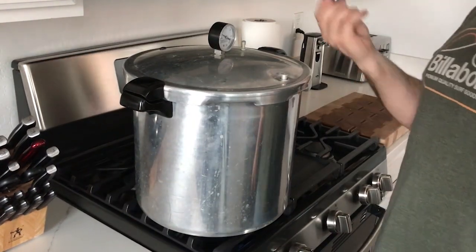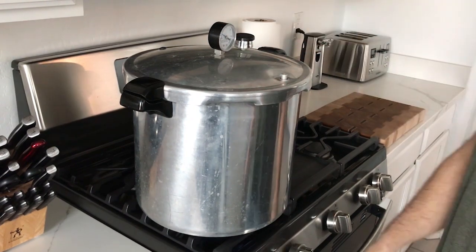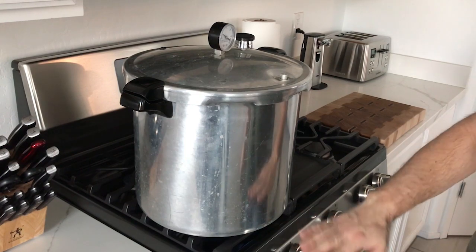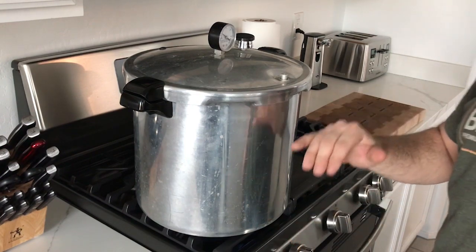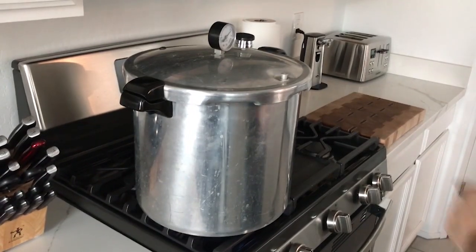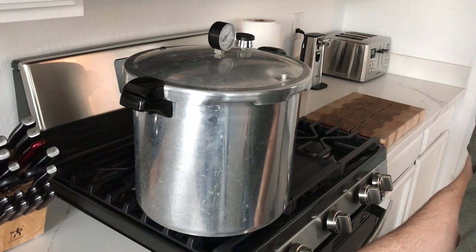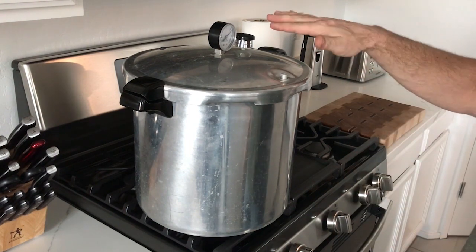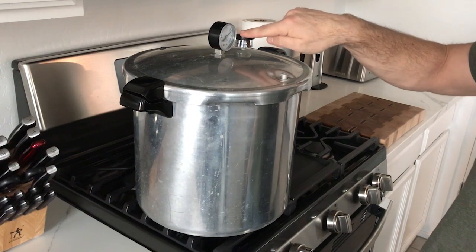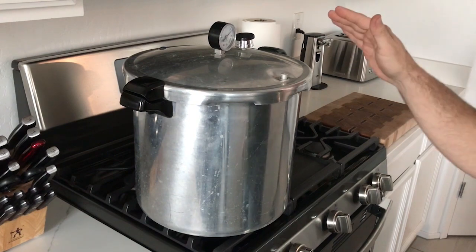It's been 15 minutes, so put your 15 pound rocker on and wait for the pressure to build up to 15 PSI. Use your heat to stabilize it so it just maintains that 15 PSI. You can see it start to knock a little bit — bring your heat down to stabilize that. You're just looking for that knocker to barely be moving or not at all, with the needle pointed right at 15 PSI. We're going to leave it here for 30 minutes.